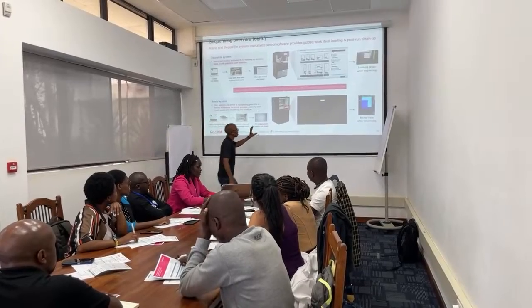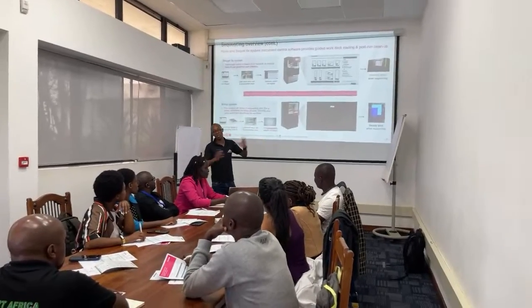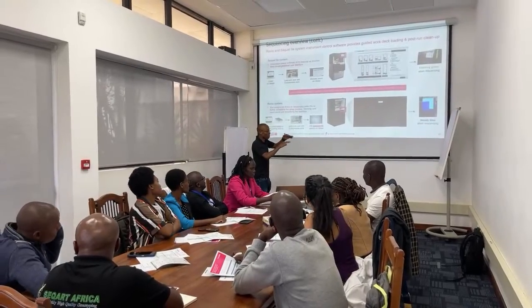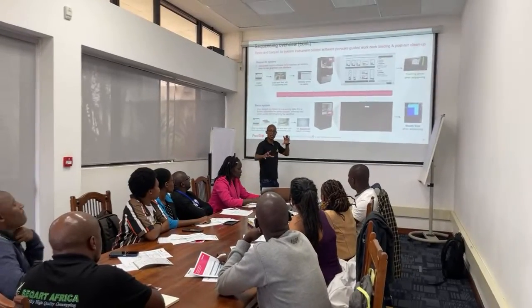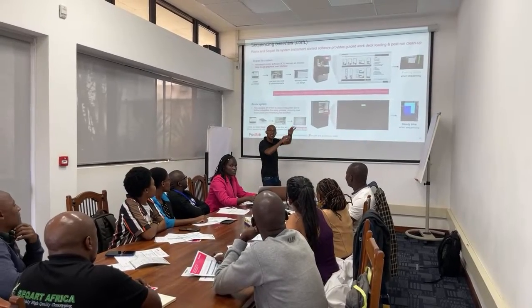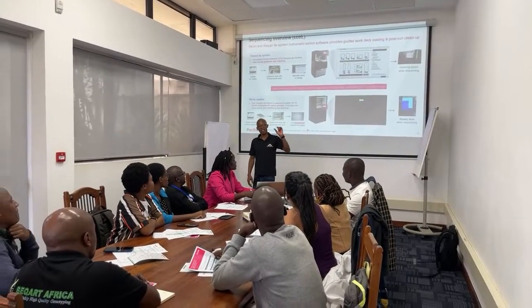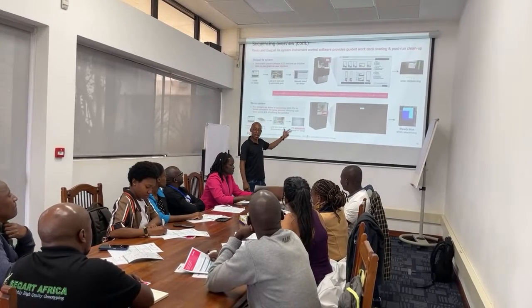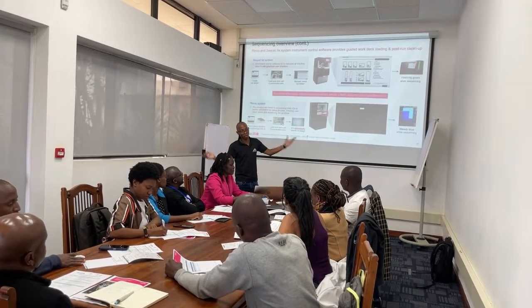So everything is processed in the computer: the demultiplexing, post-run cleanup, and HiFi reads. After you have done that, there's a step called CCS processing. That's when it takes all those reads and generates HiFi reads. All of that happens in there. So what you get out of that machine is HiFi reads, low file size. You can demultiplex right in there, and then just do your secondary or tertiary analysis from wherever you are.